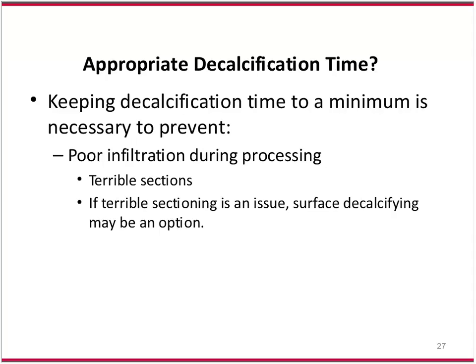Then you have to obviously back them up, go through a reverse processing step, put them into decalcification agents, and hope that everything will be okay. Obviously, reprocessing isn't something you want to do either, but it can be done. And if that's how you have to save your samples, that's what you have to do.